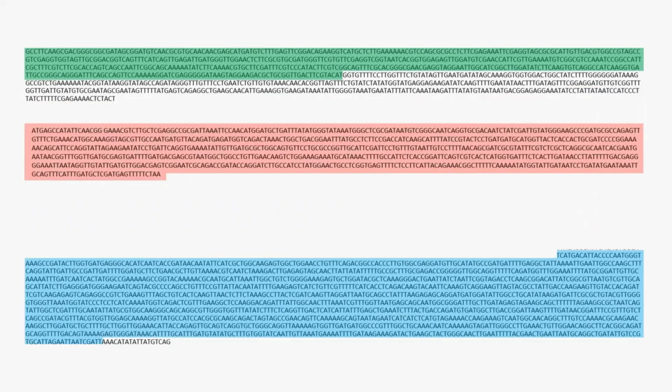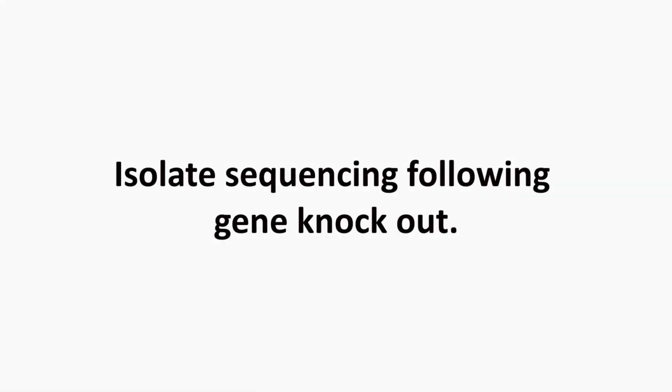The highlighted sequence in red illustrates the gene we want to insert within this region. For this example, the sequence is a kanamycin resistance gene. We will also design our primers to keep a promoter sequence for the kan gene. The promoter will be from our genomic sequence as highlighted earlier. The previous short clip highlighted what we set out to do.